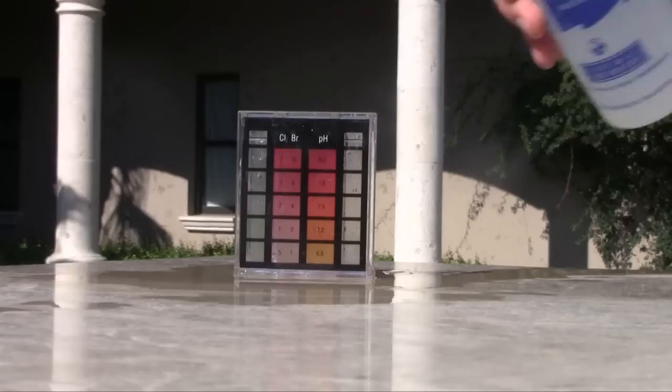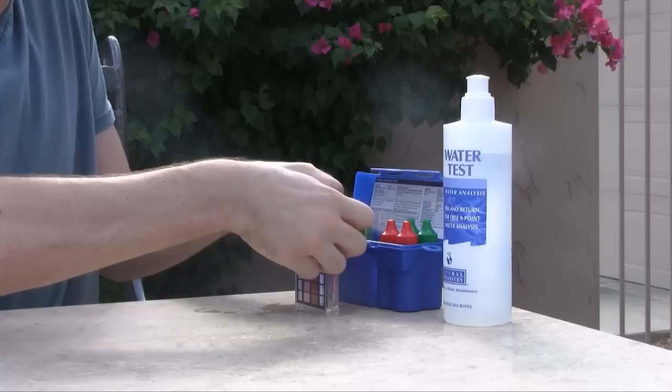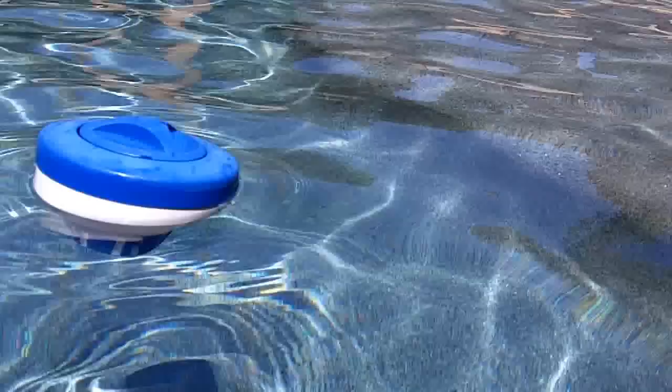Next, you'll want to measure the chlorine in the water. Fill the smaller side of the test vial to the top line and add 5 drops of reagent R1 and 5 drops of reagent R2 to the test sample. Place the cap on the test vial and gently invert to mix the sample. Compare the color of the test sample to the color guide on the test vial. Your chlorine reading should be between 1 and 3 parts per million.